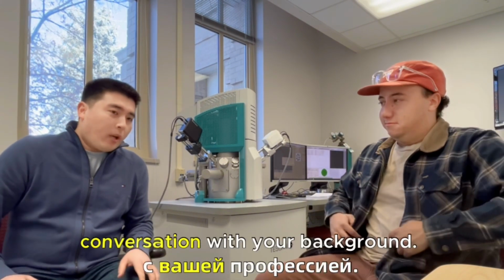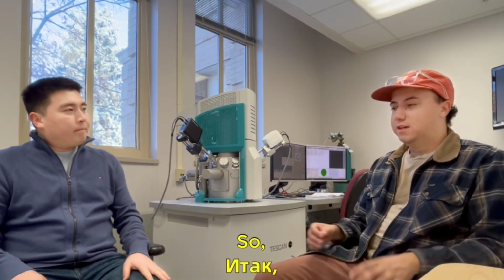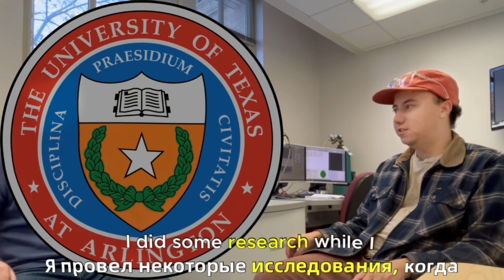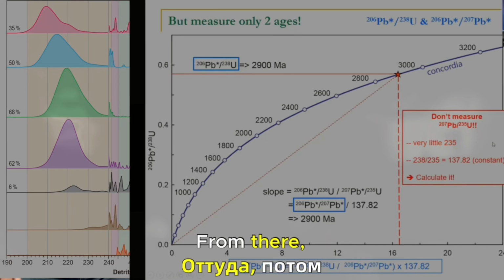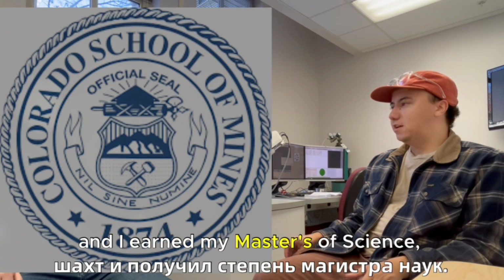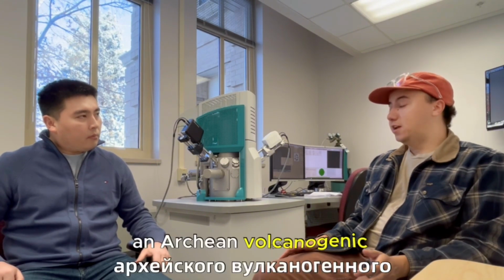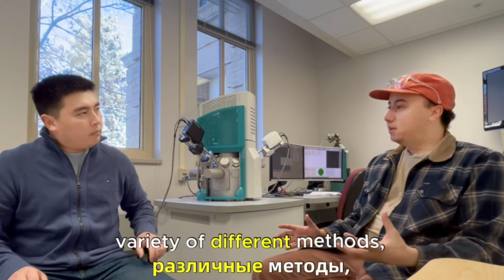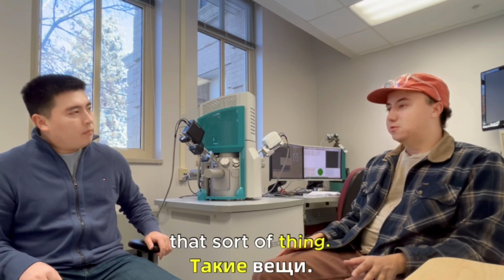So let's begin our conversation with your background. Could you tell me about your background, education? Sure. So I have a Bachelor's of Science in Geology from the University of Texas at Arlington. I did some research while I was there on detrital zircon geochronology. From there, I went to Colorado School of Mines and I earned my Master's of Science looking at the critical mineralogy of an Archean volcanogenic massive sulfide deposit, VMS deposit, specifically focusing on tellurium and telluride minerals. And through that, I used a variety of different methods, including SEM-based automated mineralogy, electron microprobe, that sort of thing.